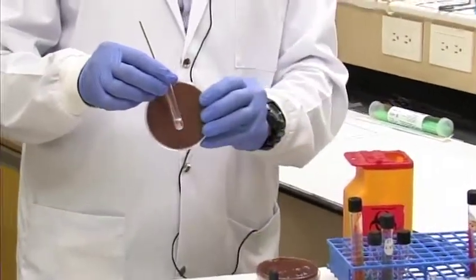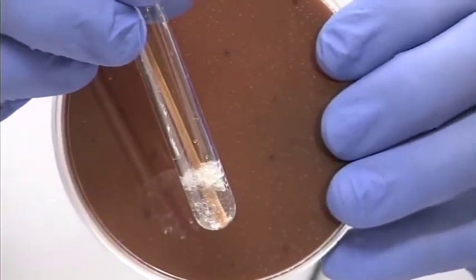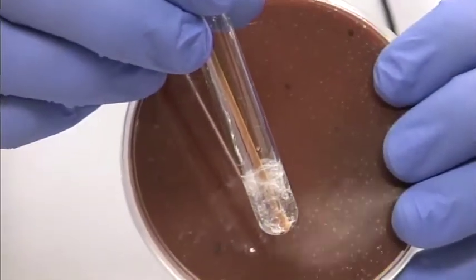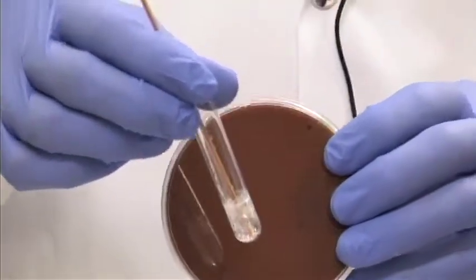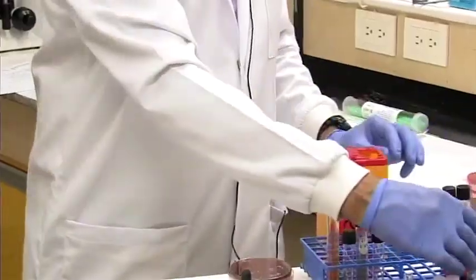So here we have immersed it, and if you look carefully, you can see bubbles being given off from the reaction. So again, the reaction is the enzyme catalase, which is possessed by the bacteria, breaks down hydrogen peroxide into oxygen and water, and the bubbles you're seeing is the liberation of oxygen. So that was your catalase test.